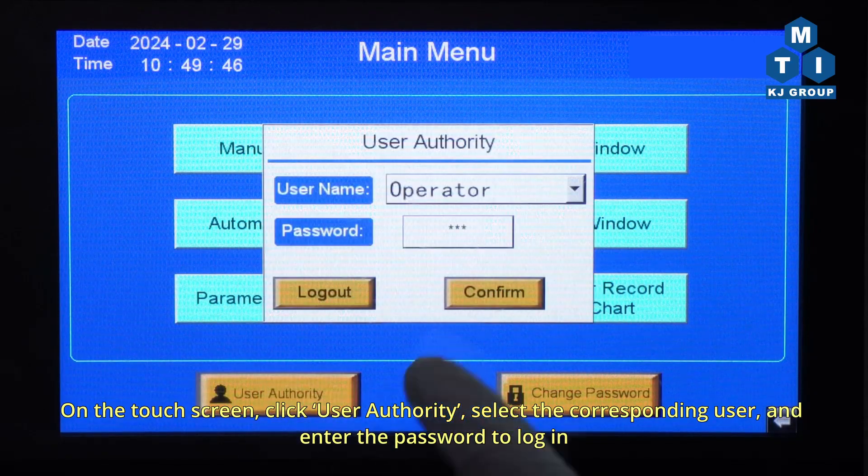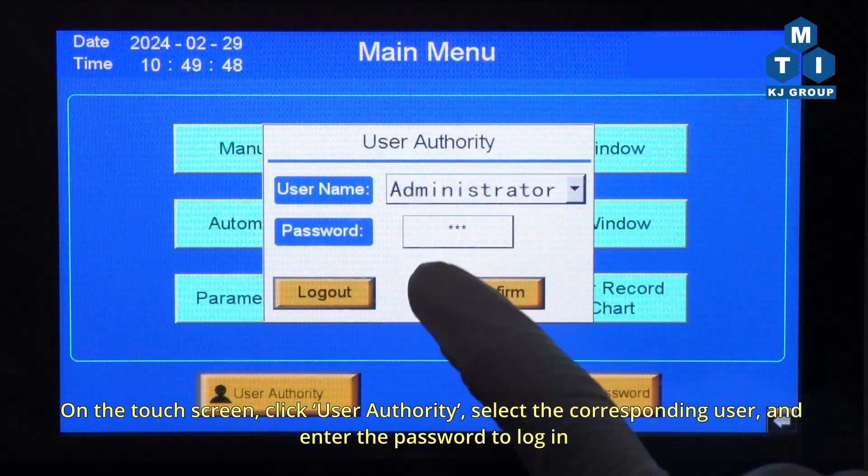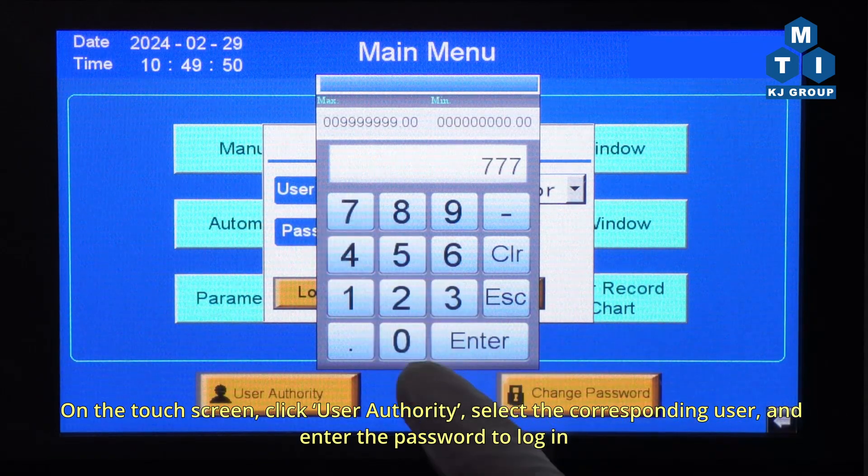On the touchscreen, click User Authority, select the corresponding user, and enter the password to log in.